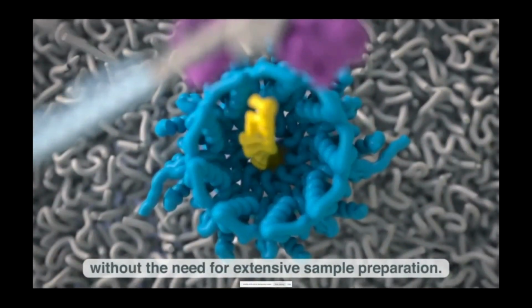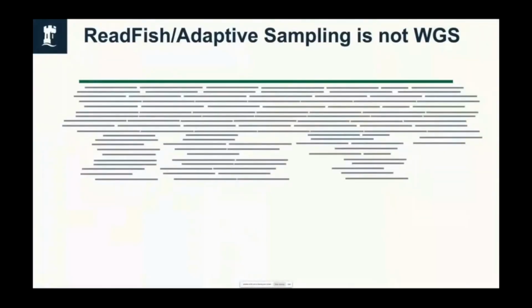We were involved in establishing this method, and I just want to draw a distinction between adaptive sampling and whole genome sequencing and explain some of the benefits, but also some of the things you don't get. So when you're doing whole genome sequencing, you expect to get uniform coverage of your reads across the whole genome that you're sequencing.